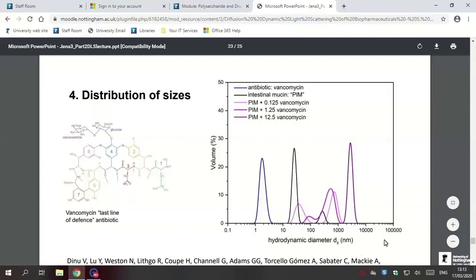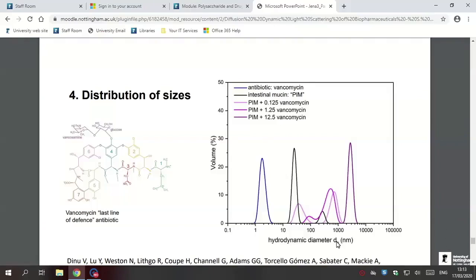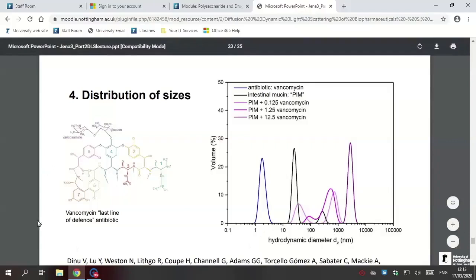And in running the software in these DLS instruments, you have a choice of working in diffusion coefficients, in the hydrodynamic radius, or the radius of the equivalent sphere, or the hydrodynamic diameter, or the diameter of the equivalent sphere. Here it's set for diameter.